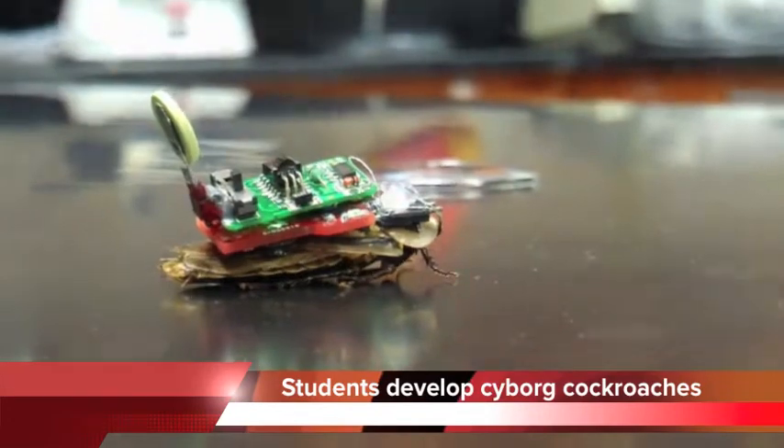Well, I guess we're performing brain surgery on cockroaches. We have a lot of cool labs — this is definitely the best. This has definitely been the most... I didn't even know you could do this, remote control cockroaches.